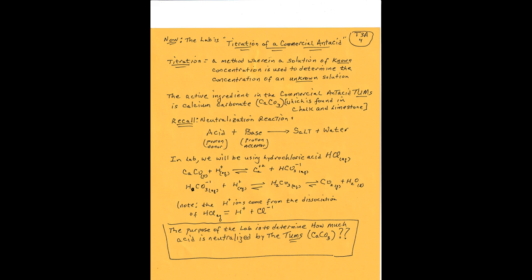And the base is calcium carbonate, because in solution, CaCO3, remember, this is chalk and limestone.